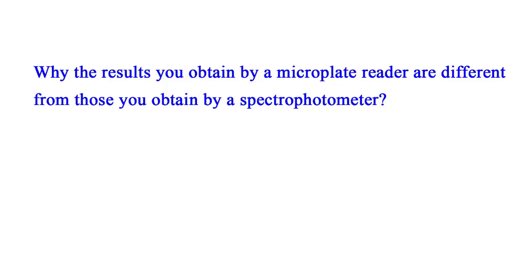I remember well when I was in the lab and a young lady student came in and asked me, "Is your microplate reader calibrated?" I became surprised. I asked her, "Why are you asking me such a question?" She replied, "Because I measured the absorbances of my samples by a spectrophotometer and the results were significantly different." I told her, "Are you familiar with Beer-Lambert law and equation?" She answered, "No."